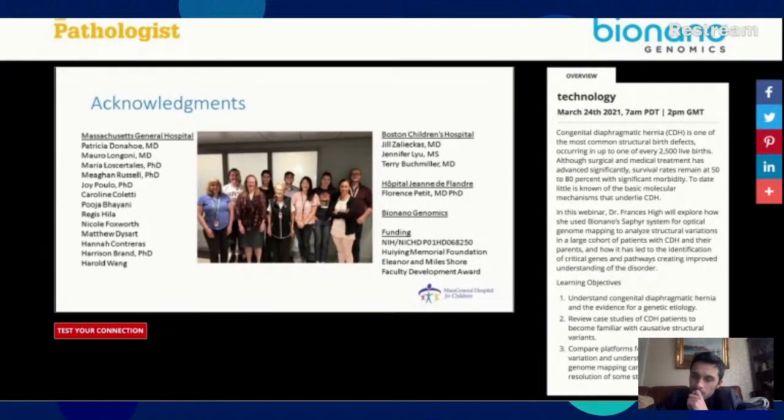Yeah, that's no problem. So I think Sven talked about this a little bit, but the source of DNA for Sapphire has to be slightly different because you need these long molecular weight DNA molecules. So he talked about how we need a fresh blood sample or a fresh tissue sample. So that's the main difference. In our particular case, we used cell lines, just because we had generated them through our study. But you can also use fresh blood, and it just can't be the same extracted DNA that you would typically use for genome sequencing.